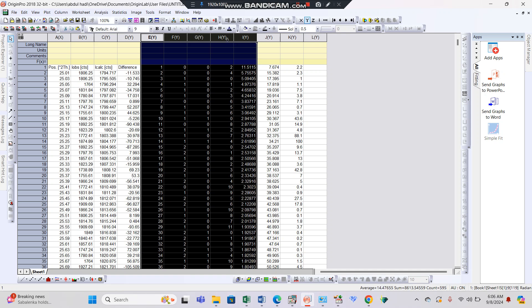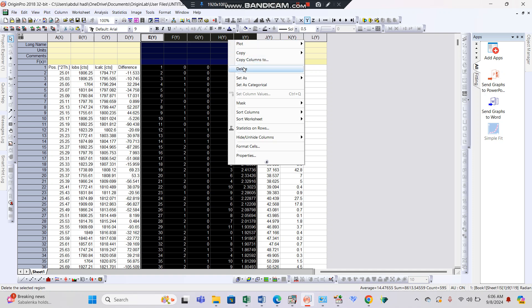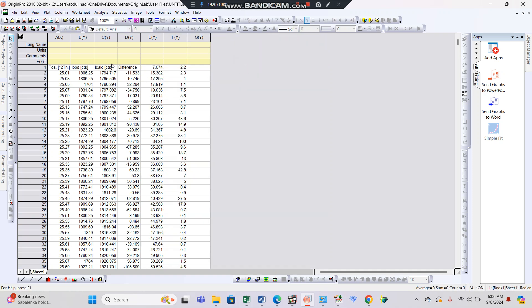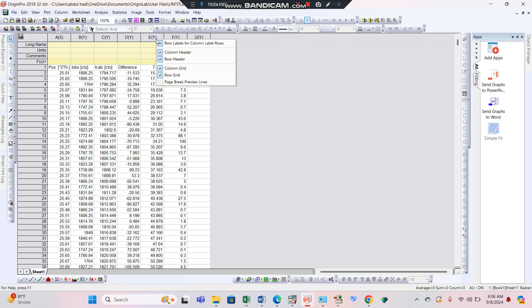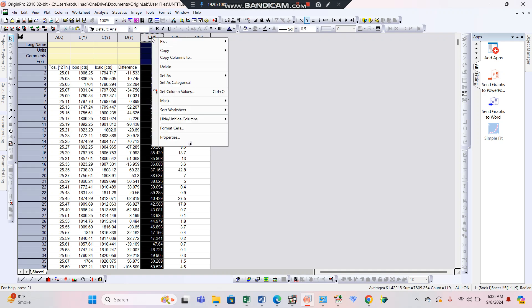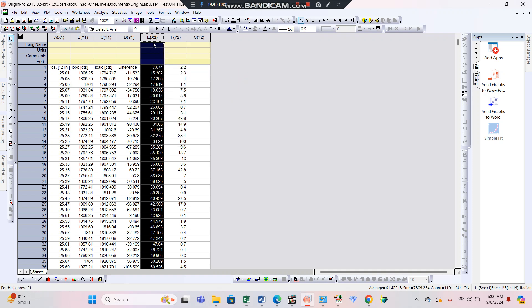We only require the position and the intensity of the JCPD card. Delete all the excess data by selecting it, right-clicking, and pressing delete. Now we want to plot the JCPD card. This is the position which should be set as x — click here and set as x — because 2-theta is the x-axis.